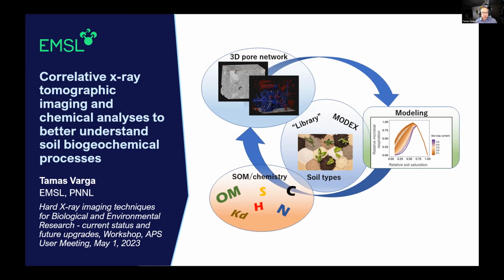And we can see the difference between the chemical compositions. These are organic groups such as saturated and unsaturated hydrocarbons, acids, lignin, and proteins. So we can, for example, look at time point number 1.